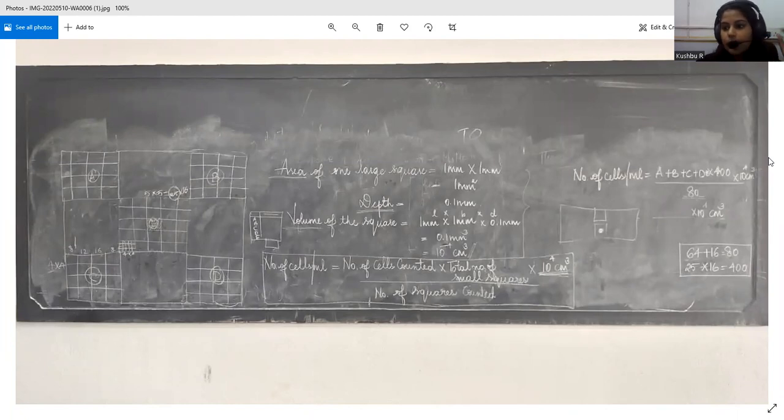In today's class, we will be going to learn about the haemocytometer. The haemocytometer is one of the important methodologies adopted to assay cells, to enumerate yeast cells, or to enumerate WBCs, RBCs, and fungal spores. It is a direct microscopic count methodology which gives us an idea about the number of cells that are there in the given suspension.